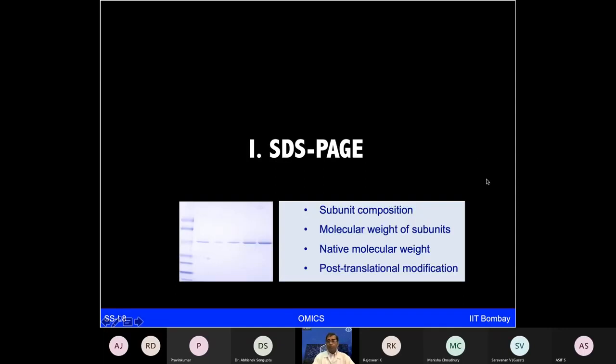I'm sure SDS-PAGE also has been done by many of you, which is the single dimensional separation of the protein. SDS-PAGE stands for sodium dodecyl sulfate polyacrylamide gel electrophoresis, where in the presence of the detergent SDS, you are trying to bind that with the protein of interest, or all the proteins present there, and you are making them negatively charged, and then separating them in the electrophoretic field based on molecular weight. This gives you a glimpse of how the SDS-PAGE gel looks, which can be used for determining the subunit composition of the protein or looking at the specific molecular weight.